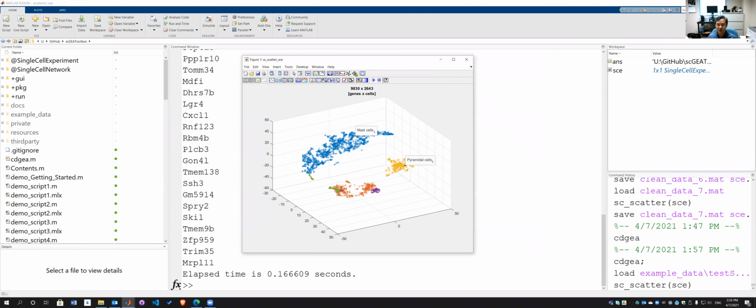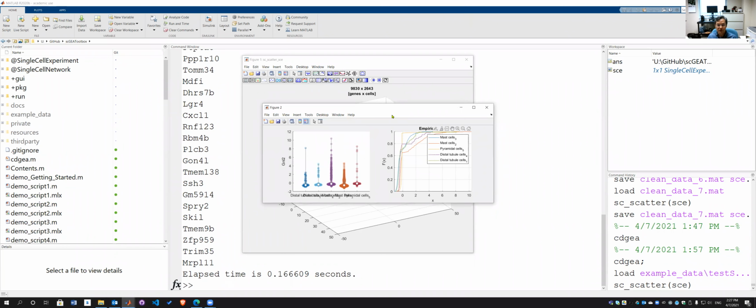And this is a two network related study. For differential expression genes, if you compare this set against that set, one of the buttons you can use is to compare between two classes. So you want to find this gene's expression difference between two groups, for example. This button will show you the difference.